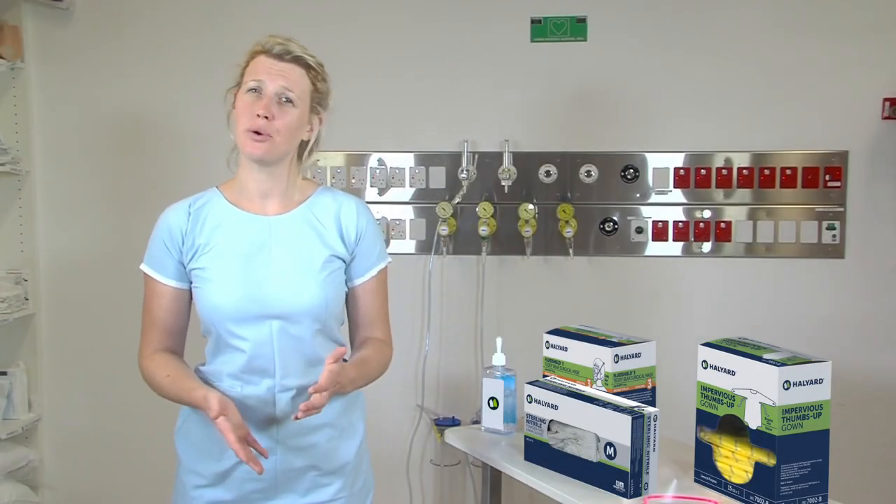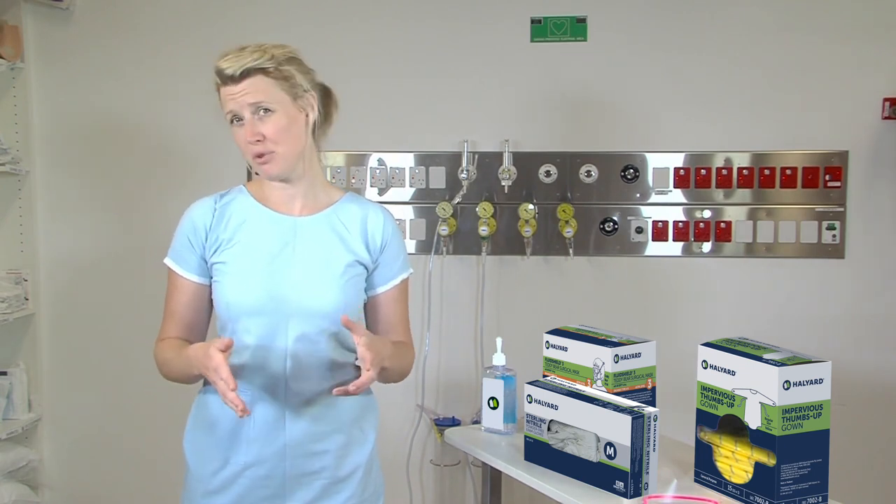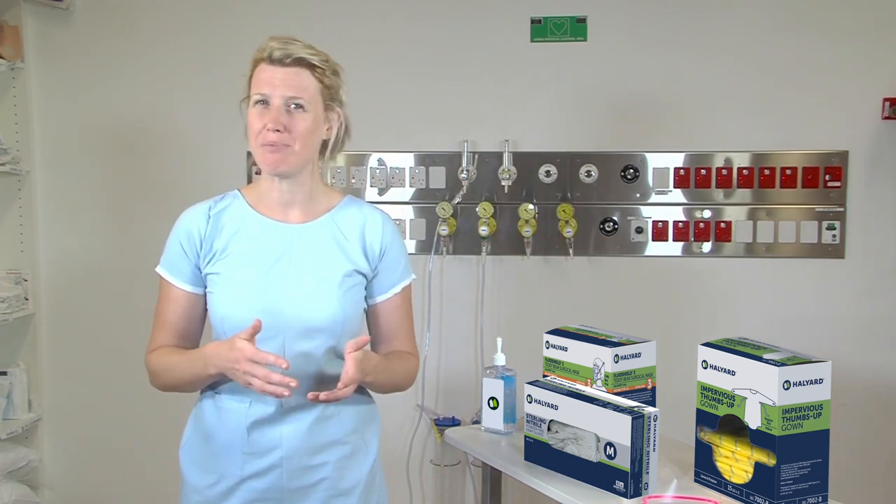Hi, today I'm going to be talking you through the donning and doffing — or putting on and safe removal — of your personal protective equipment, or PPE.